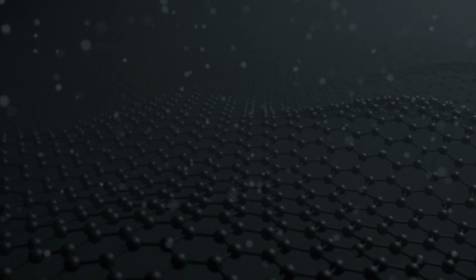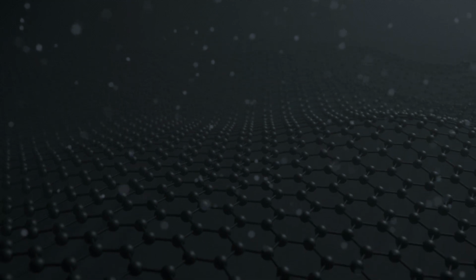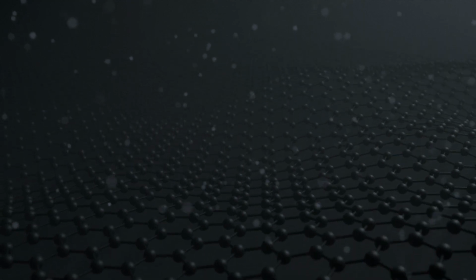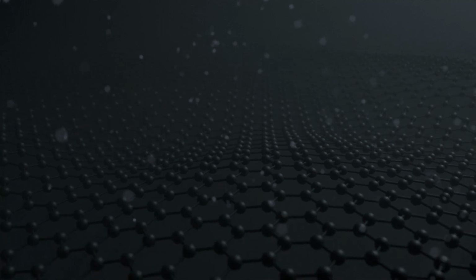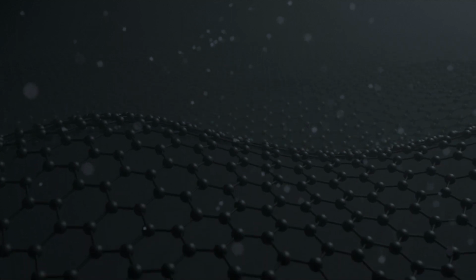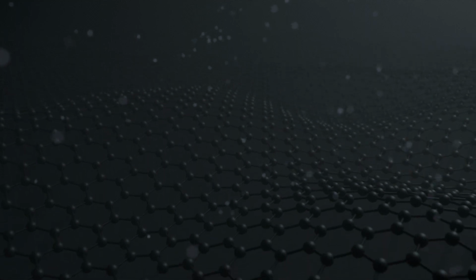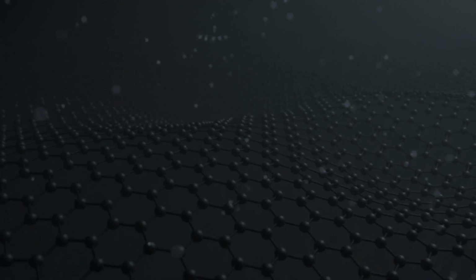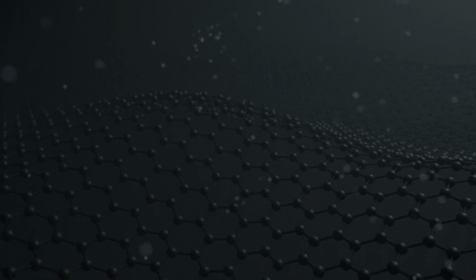Now that we know that we can attach chromium atoms to the graphene lattice, we would like to start exploring what different structures might be possible to form. There are many possible stable structures for dopant atoms attached to the graphene lattice. So many, in fact, that an exhaustive theoretical exploration is not tractable. Moreover, even if we knew every stable structure, it would not be obvious which ones we would be able to drive the system into. Instead, we can take the opposite approach and document which structures we observe and perform theoretical investigations into this much smaller subset of structures to see if they might be of interest.